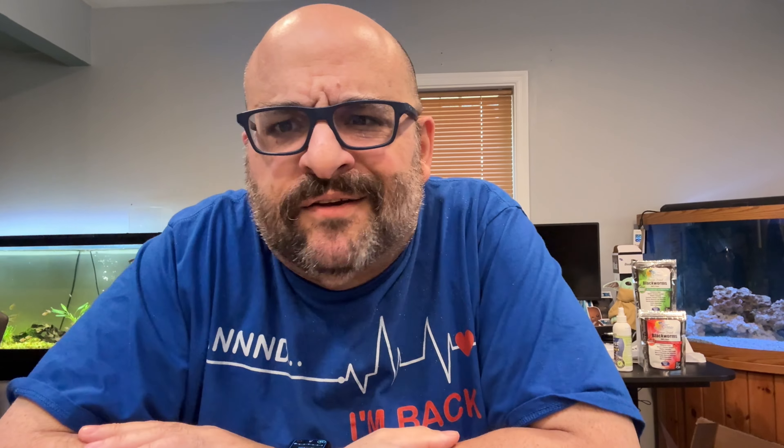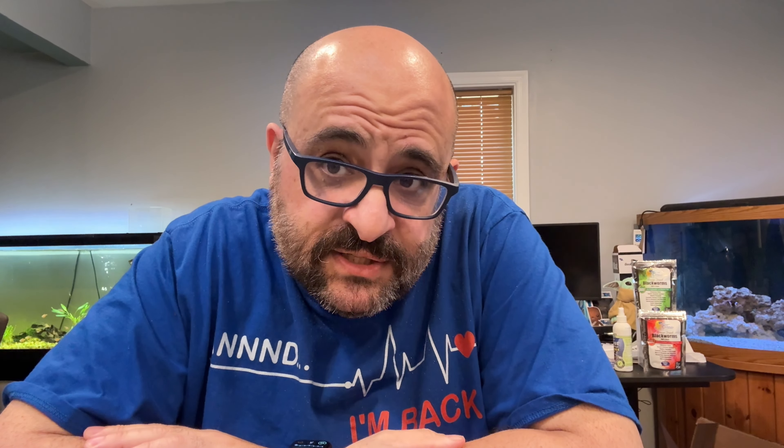My good friend Keith from KGE Aquatics sent this Fritz freshwater and saltwater master test kit to me to try out, so I did get this for free. As always I tell you that, but as you know if you watch any of my review videos, that doesn't really matter. We're going to unbox it and try it for the first time together.